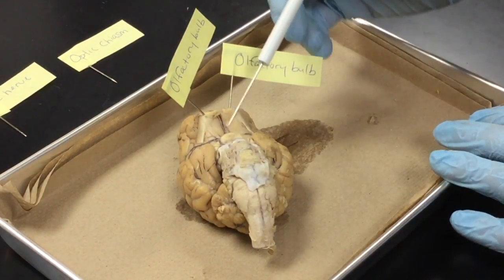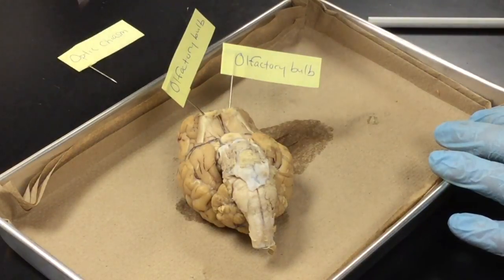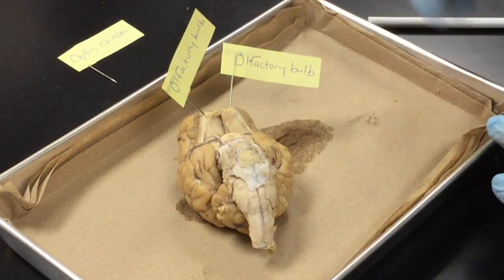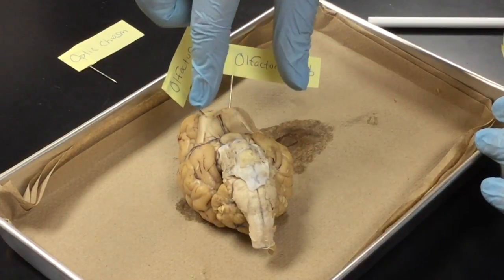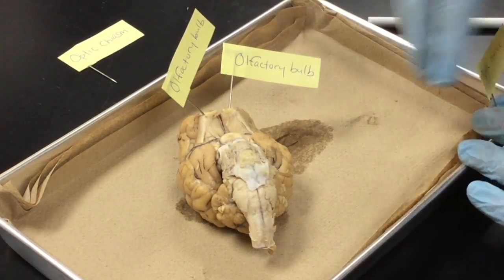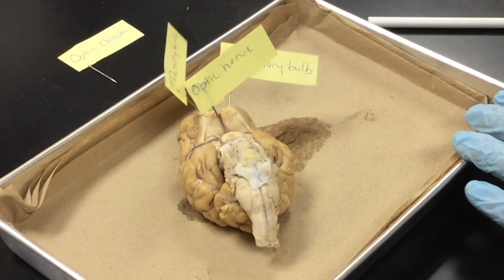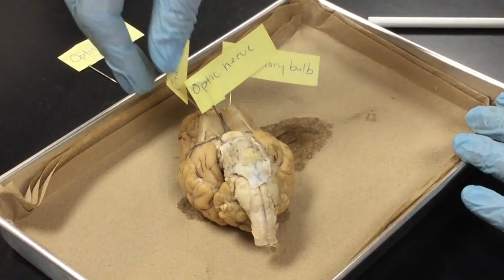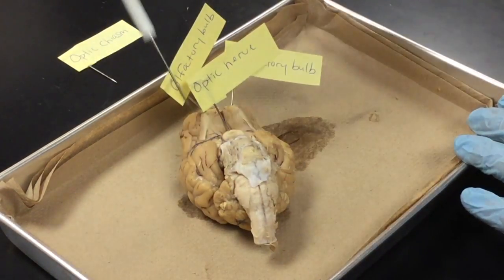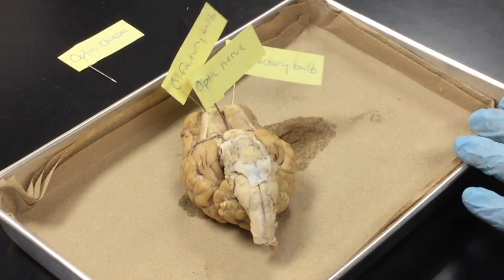Now this region right here is extremely important. It is called your optic nerve. Now the nerves itself are going to kind of split off in a Y shape, but as you can see, my optic nerve has been severed. This is where information from your eyes is going to be transmitted into your brain. So here we have the olfactory bulbs, these regions, and the optic nerve.